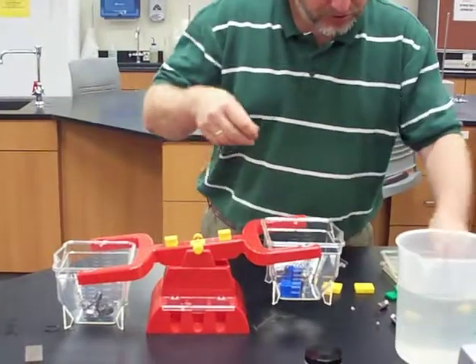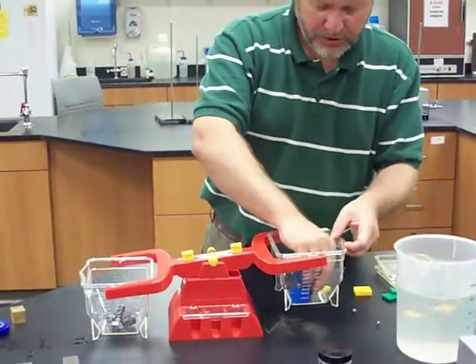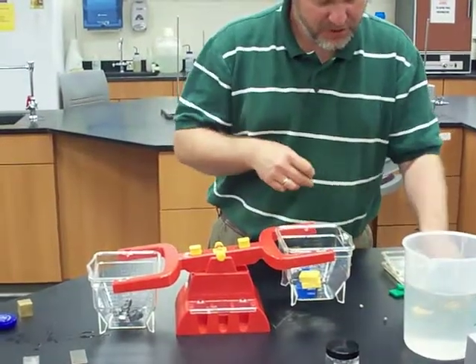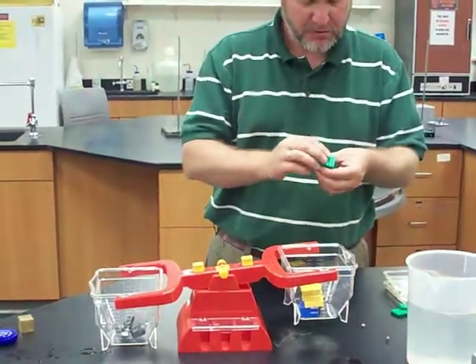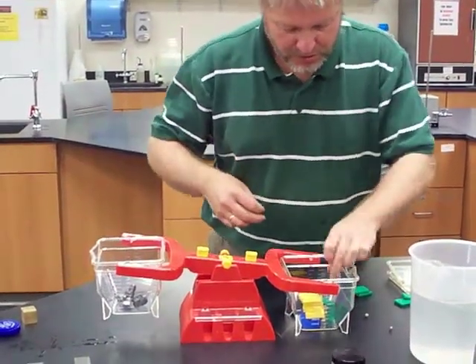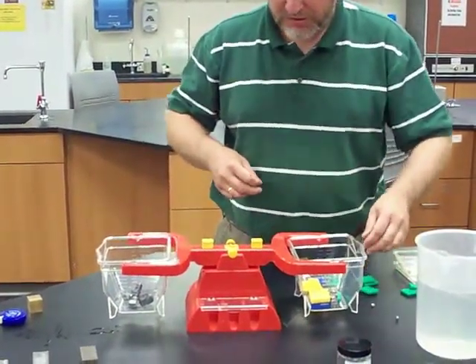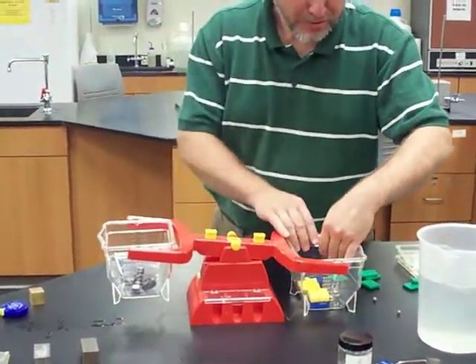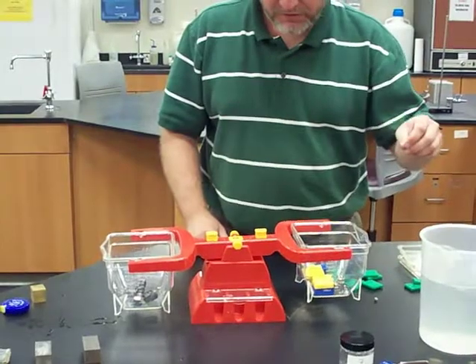That's 90 together, 110, 130, 140, 150, 160, 170, okay, 190, 180, 175, okay. 170, 172, 173.